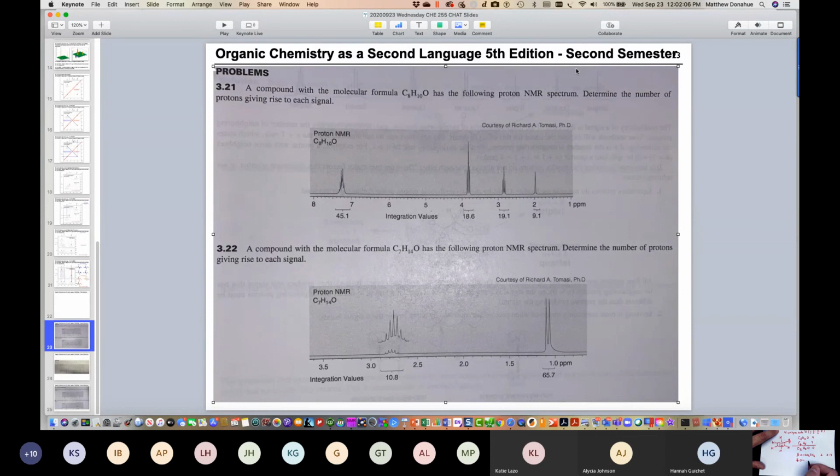What about this? I don't want to do that. I wanted to do CH2O, CH3. That's sort of the same, 2 unique sets in a ratio of 2 to 3. And sort of what we're going to do is just march this oxygen out. CH2, CH2OH. Now we have 1, 2, 3 unique sets in a ratio of 2 to 2 to 1. So that matches sort of the data. So this must be the other fragment.